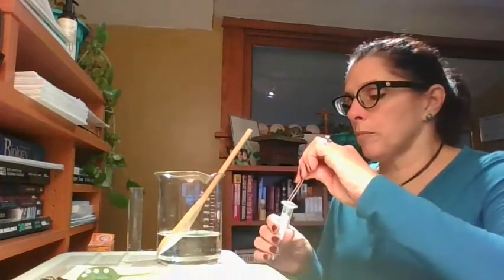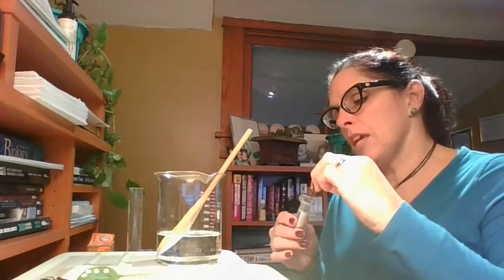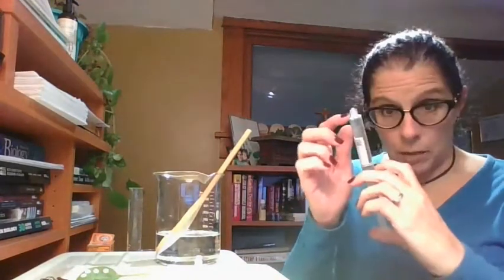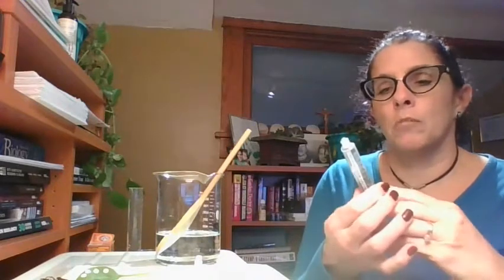All right, I got to push them down, but they're going to go down anyway when I put the plunger back on. These little plunger thingies are very hard to work. They all have caps, but the cap does not work very well to do what we need to do. So you got to use your fingers, and it's lightweight painful. I got the leaf discs in there, and now my job is to push them all to the tip down here. So I'm going to just push the plunger in, maybe. There. Push the plunger in and get them all down near the bottom.